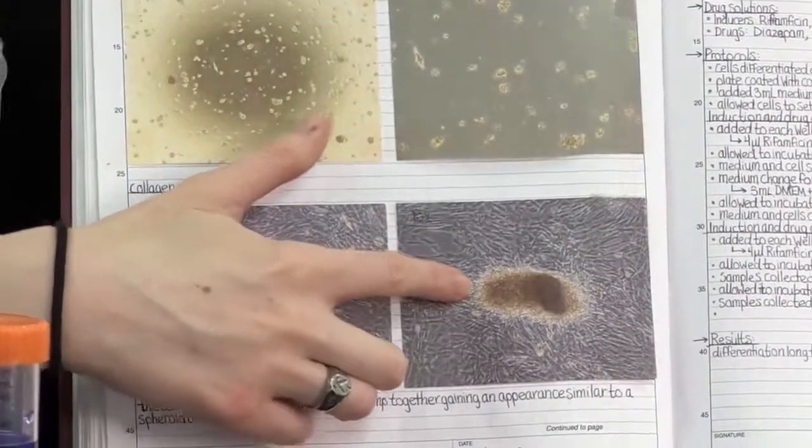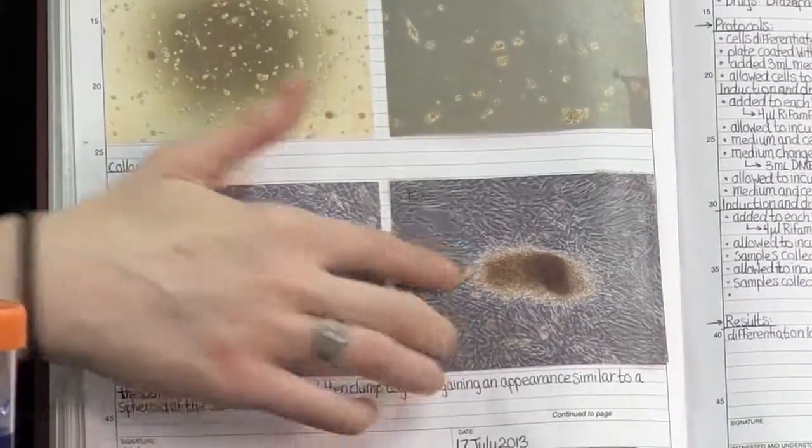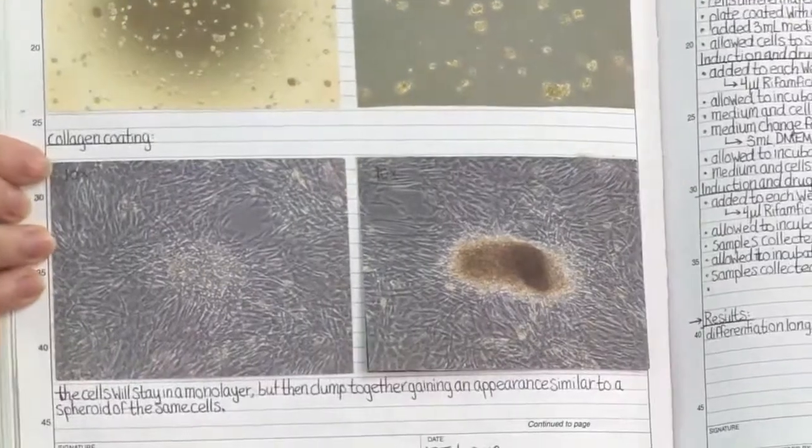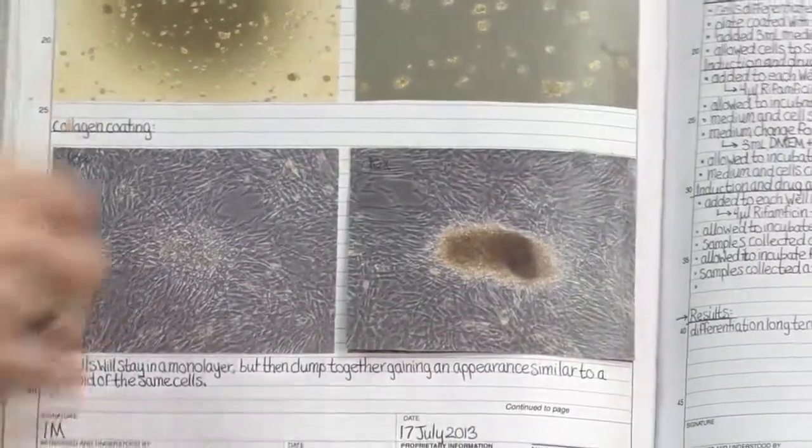And seven days later, they formed this giant structure, this blob shape. So that was really helpful for me to look back and say, oh yeah, these cells have definitely changed over time.